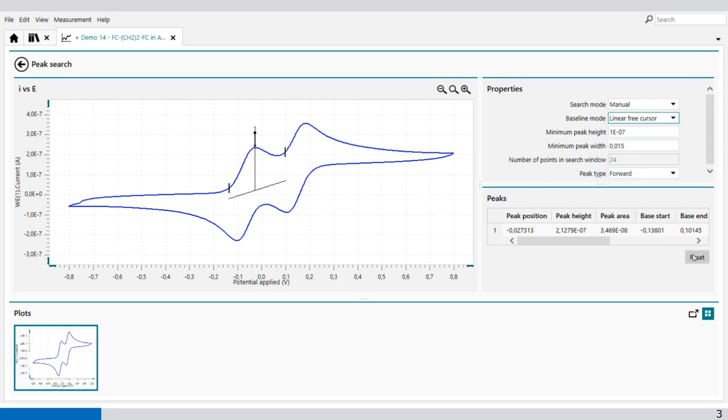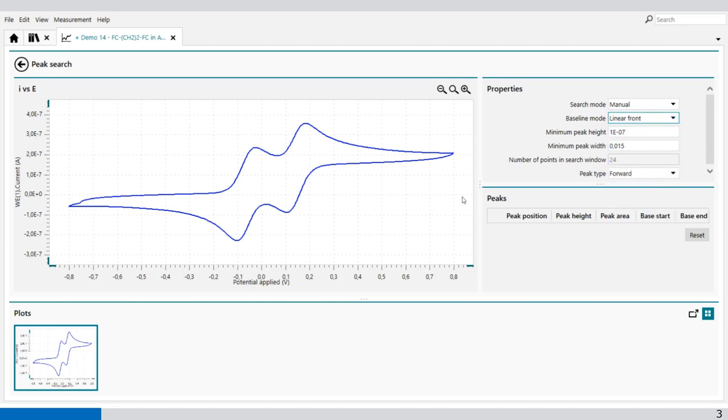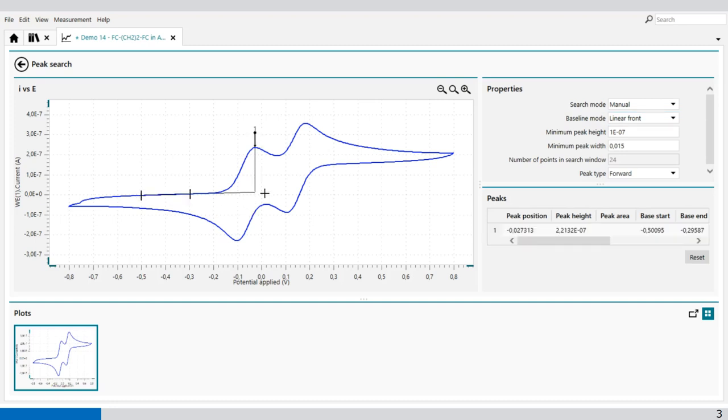Then we have the linear front. With linear front, we select two points in the front of the peak, like these two. And it gives you the peak height and the peak position.